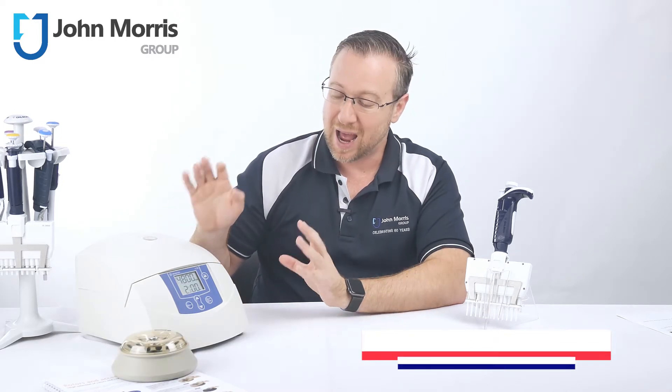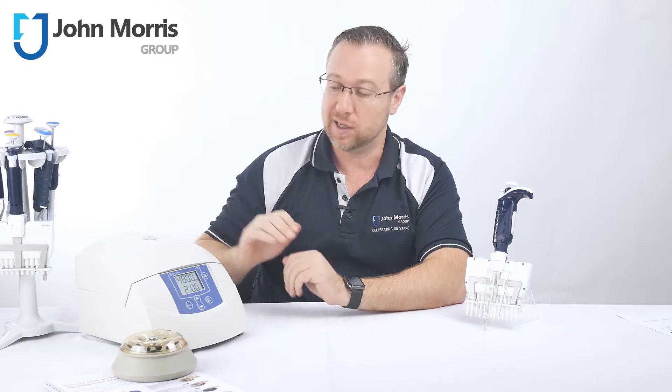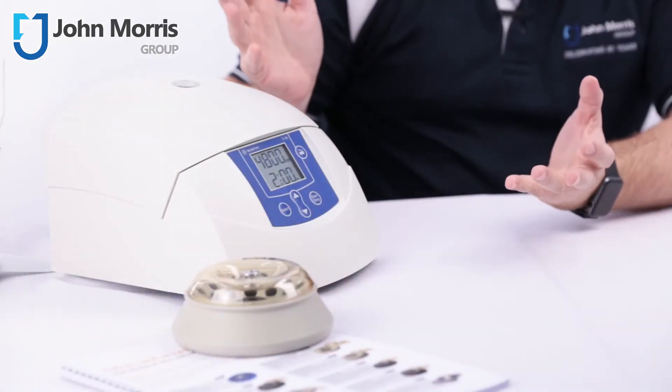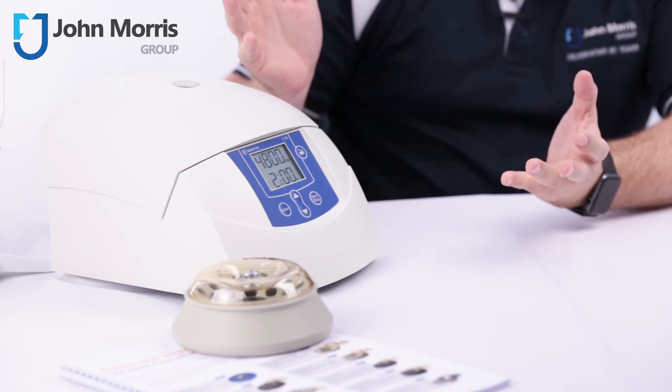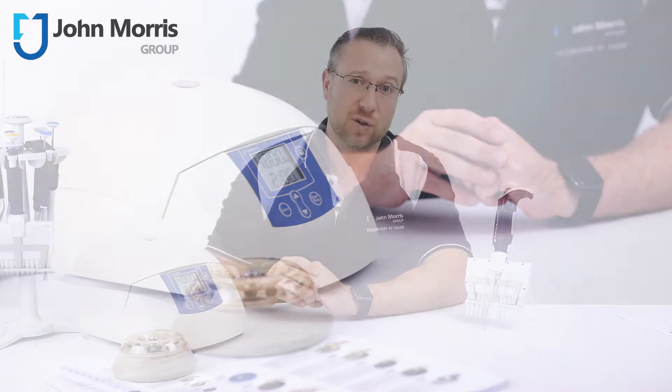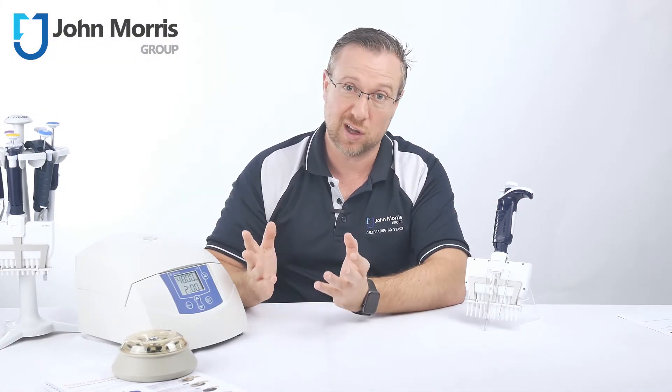We literally sell hundreds of these units and virtually never see one come back for any repair. They tend to last, from what we can tell, at least 10 years in the field, if not more like 15 to 20 — which can be a problem if you're trying to sell new units, but it's great for you if you want your microcentrifuge to last just about forever.